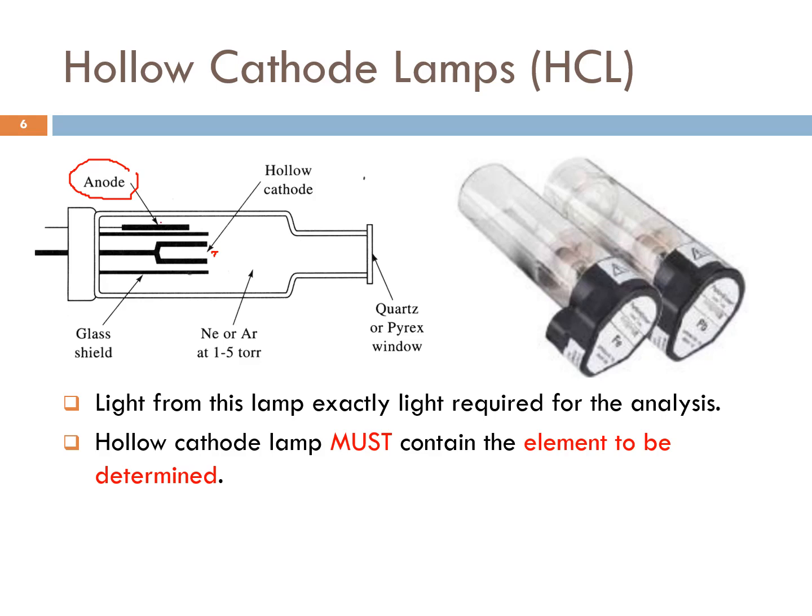Okay, so both the anode and cathode here ni are sealed in a glass tube filled with inert gases, whether neon or argon at the pressure of 1 to 5 torr.